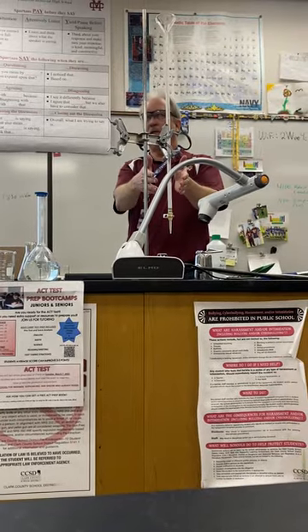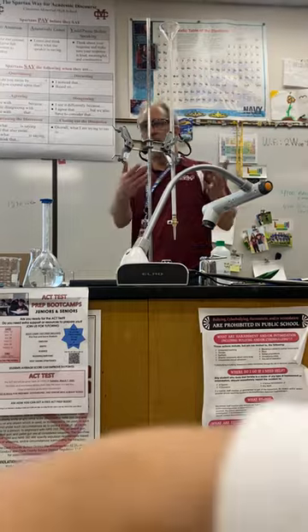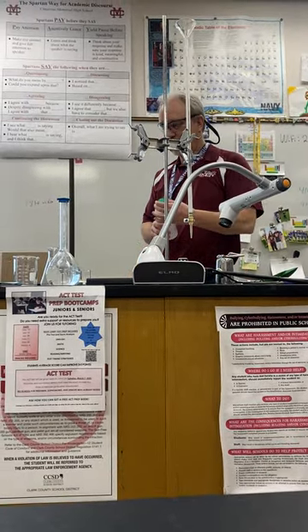Wash this out really good and rinse it with DI water. And then I'd be ready to put whatever titrant I want in there. So let's say this is my unknown.